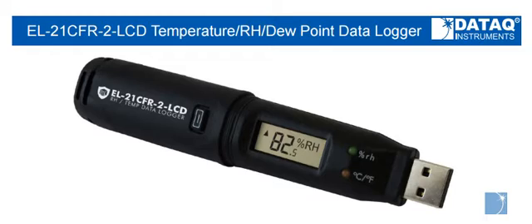With a lithium-ion battery rated for up to two years, the EL-21CFR-2-LCD allows you to sample at intervals from once every 10 seconds for 45 days to every 12 hours for a couple of years.